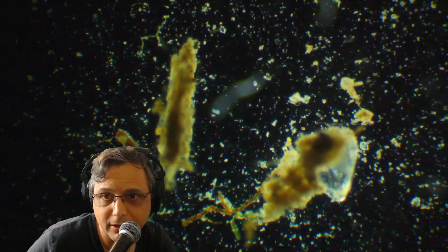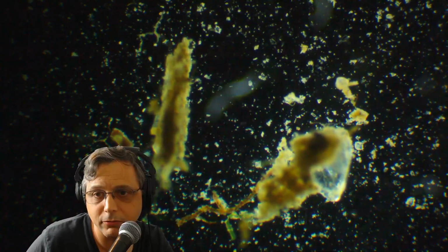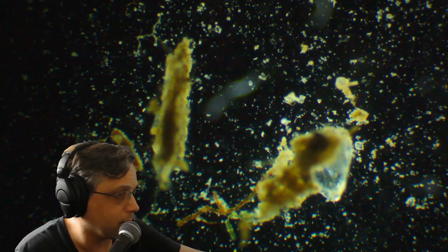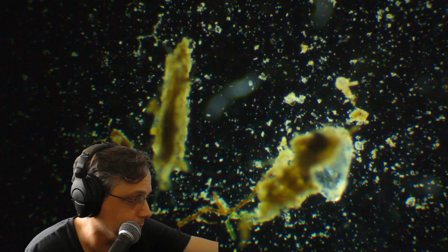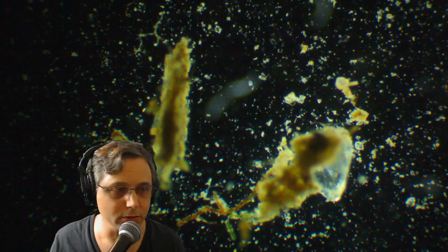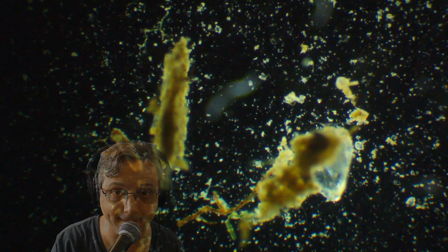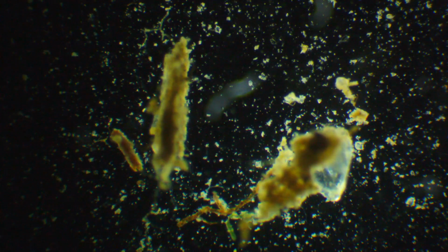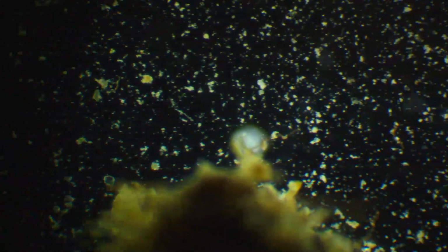Look at these little guys, these little lumpy guys. I think they're paramecium. I don't really know for sure. I call them lumpy guys because they are sort of lumpy. They're not perfectly roundish. Here, I'll take myself off the screen. They're very small, though, and they move very quickly.